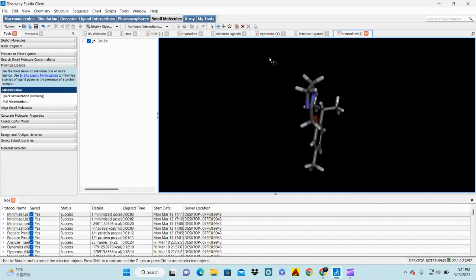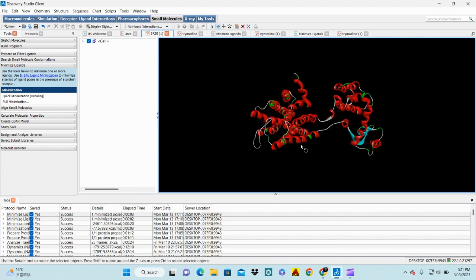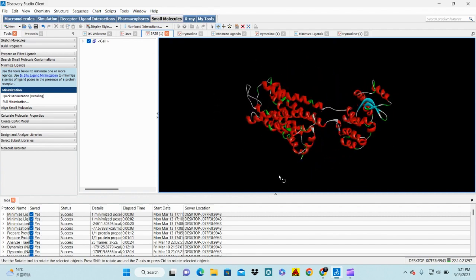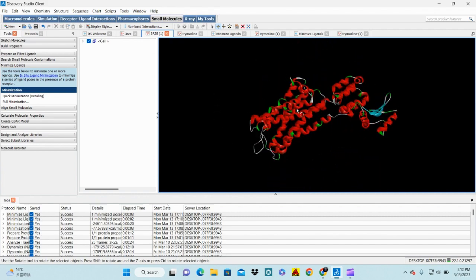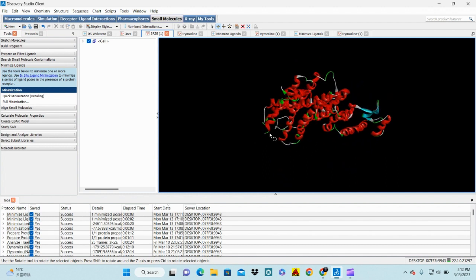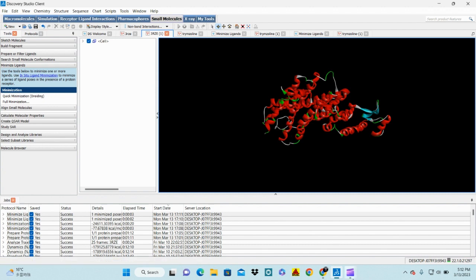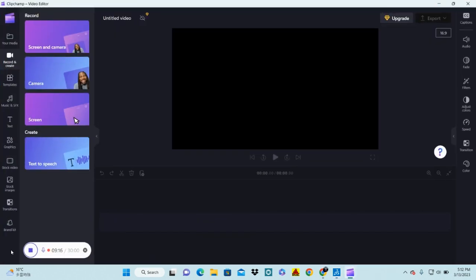Our second-round minimized ligand molecule is now prepared. Both the ligand and the protein are ready. In the next step we will learn how to dock these two molecules, what the docking protocol is, and how to find the binding site. Please comment on the video if you have any queries. Thank you very much.